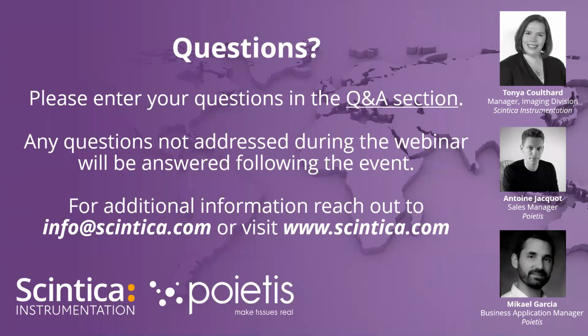Got it. And just a follow-on question to that, perhaps you can describe a little bit more how the hood works, just to ensure that as that glass is opening, the laminar flow is maintained and that the sterility within the hood is maintained as well. I presume it functions very much like a normal safety cabinet in that if you raise that window below a certain speed, you're not ripping it open very quickly, the laminar flow would be maintained. Yeah, exactly.